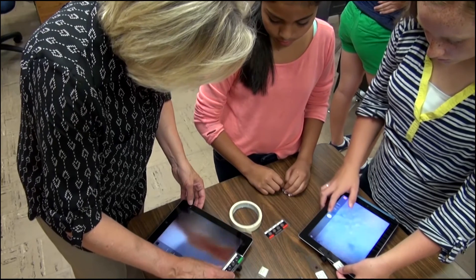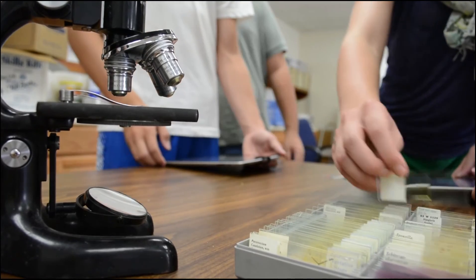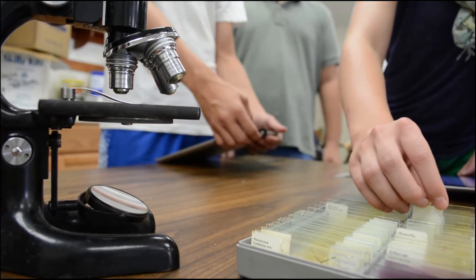For education, it gives opportunity to all sorts of different backgrounds, be it elementary school all the way up to high school, and even just a career scientist too. The ability to look at microscopic organisms easily without having a big bulky microscope is a beautiful thing.